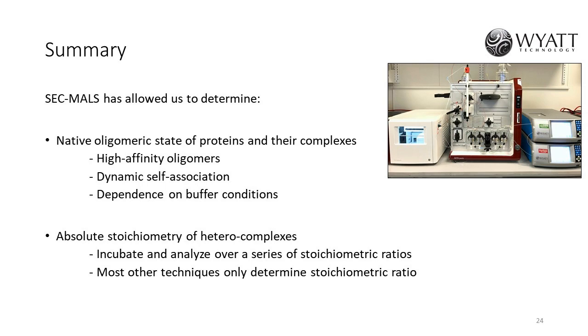So we are using the GE Superdex 200 Increase 10/300 GL column. That's the column that we use for our SEC-MALS analysis.